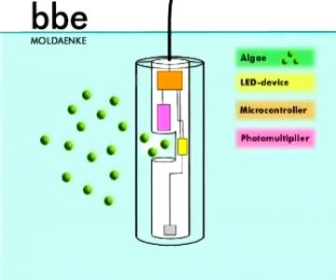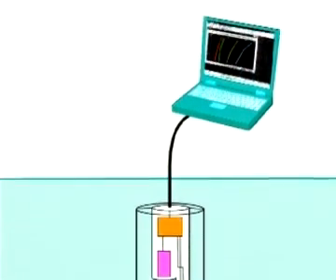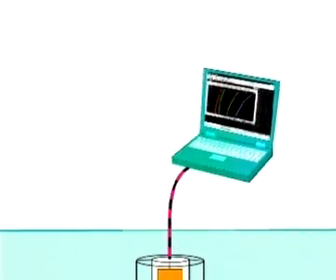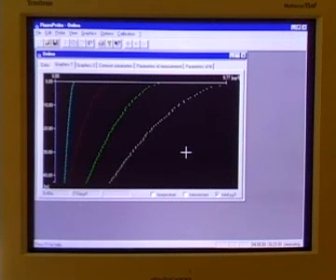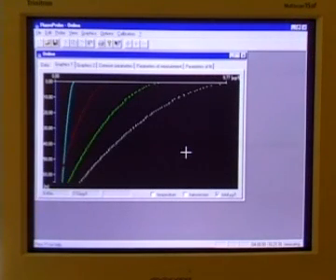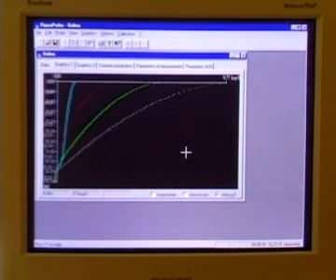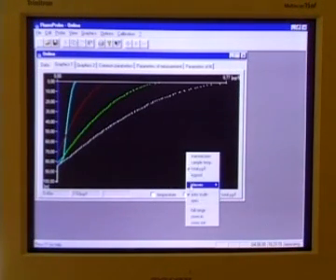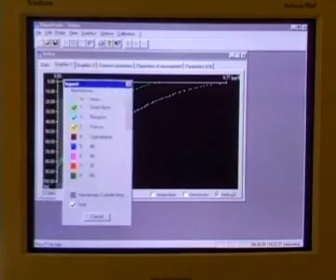Measurement of the pressure enables the calculation of the water depth. Chlorophyll A fluorescence corresponding to the different pigments of the specific algae is recorded. Data may be stored in the probe or sent onto the personal computer. As the FloraProbe is on its way deeper into the water, data is sent online to a computer where the software visualizes the distribution of the different algae classes on a display. Each algae class is represented by a different color.